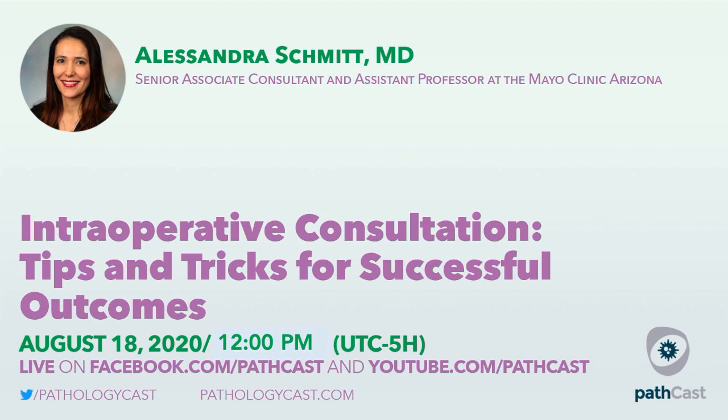Here's the next question. Do you ever do immunohistochemistry during frozen section evaluation? We do not, no.